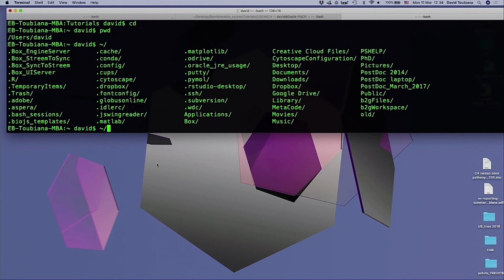Blast. Yeah? Who knows what they're doing when they're running blast? Yeah? Okay, that's what I was expecting. So when you run a blast research and when you go to NCBI, you will have those different options.